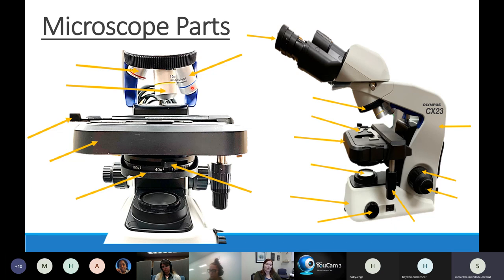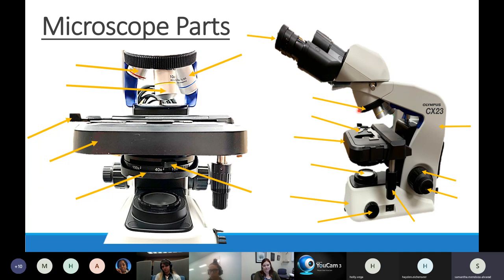When looking at a specimen, you'll probably go from the red scanning objective, where we always start, into the yellow objective, and if something is really small, all the way up to blue. Our ability to change which objective we're using is because of the part holding the objectives - called the revolving nosepiece. The revolving nosepiece can revolve or spin, allowing us to pick which objective is in place.